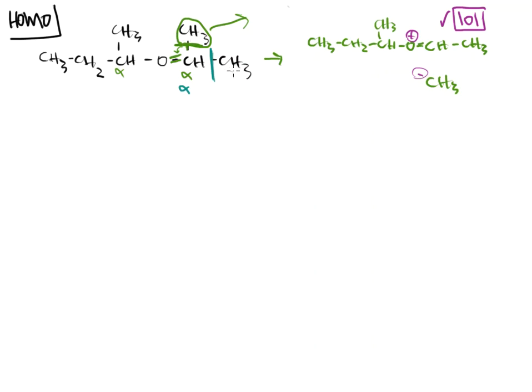In this case, it's going to release a methyl group, and we have an OCH-CH3. It's symmetrical. It's the same piece that's getting cut off, so I'm left with the same piece that's left behind. So I'm just going to say this is times 2. No matter which one I cut, it's going to be the same.